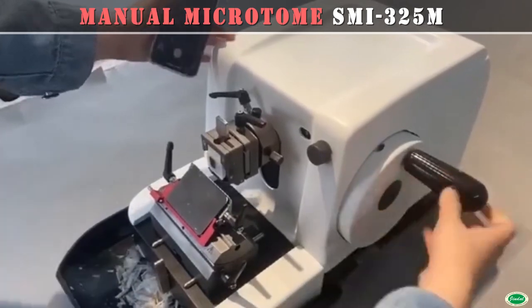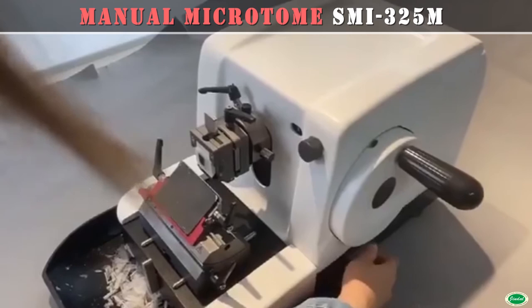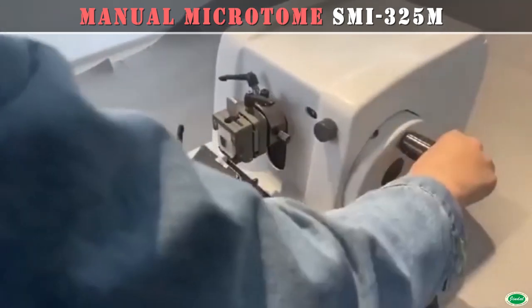These are used to produce thin sections of specimens of different hardness in both routine and research applications in biology, medicine, and industry. Manual sectioning in the high-precision manual microtome provides efficient operation with utmost section reproducibility.